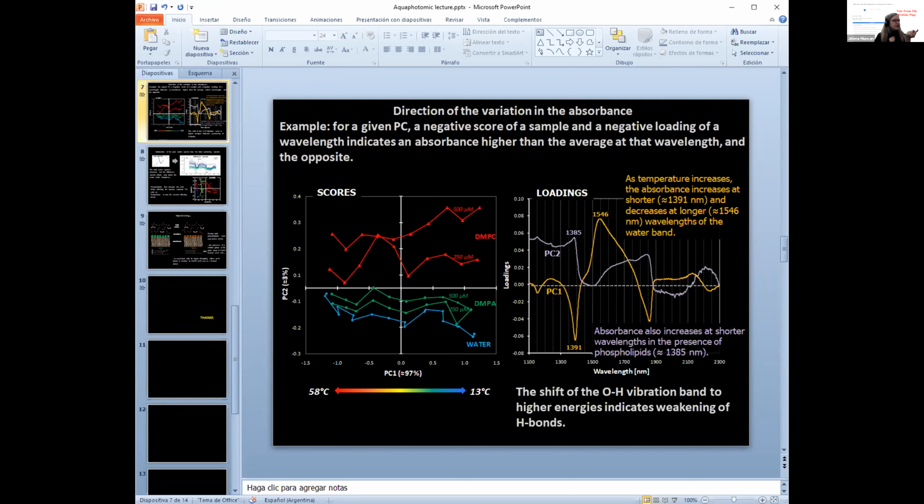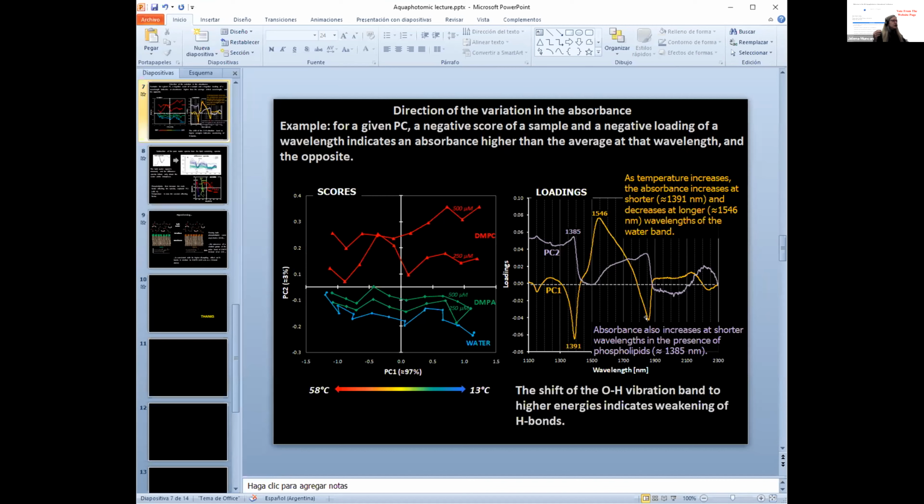Now, it was very interesting for me to see that you also have one more negative band of PC1 around 1800. This is something that we connected very much with the water activity, with the actual mobility of water species. And this is a different type of information from the first order. So it is beautiful that you see it here together.